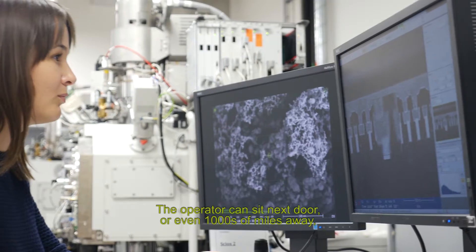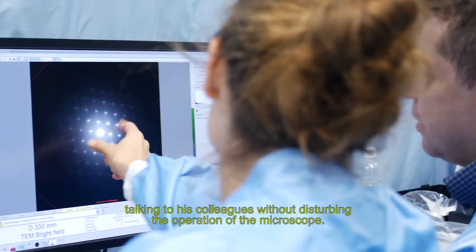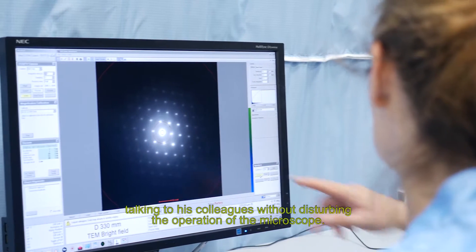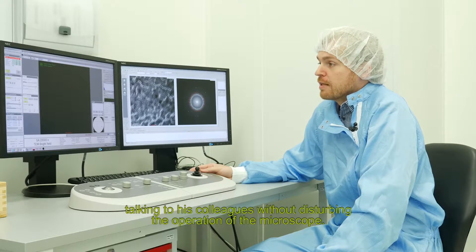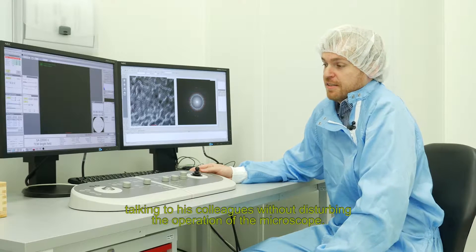The operator can also sit in the next place, where he can discuss with his partners so that they can change the image from the microscope. They can also sit thousands of miles away.